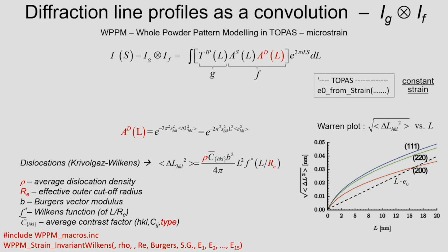It's a paper and a work I liked a lot. It was published 10 years ago, because this was really a very in-depth work on this approach of using this kind of plot here. It's a system, a material where there are no dislocations at all, but there is microstrain because of the surface, typical of catalysts. If you take catalysts, the surface is a source of strain because of the coordination of the surface, the capping agent, whatever it fell on your sample, because sometimes it's kind of random, it is influencing the surface, and then the surface will be pulling or squeezing the crystal.